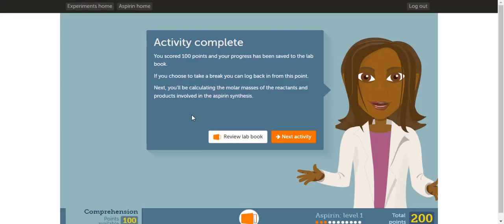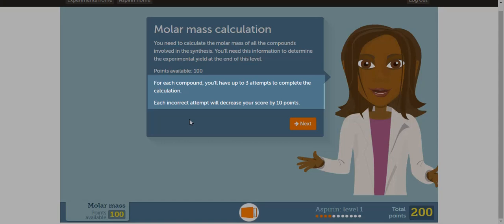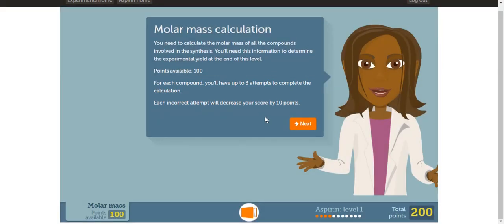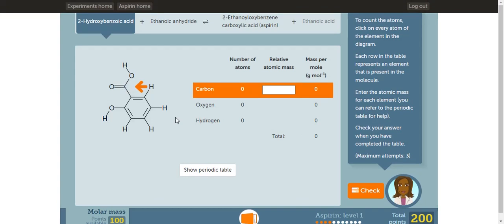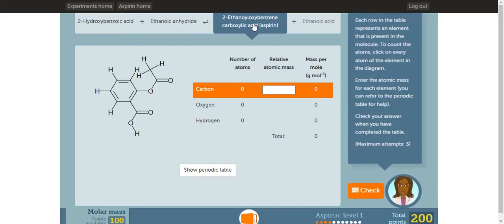The next activity involves calculating the molar mass of the reactants and products in the aspirin synthesis. Once you're ready, click next activity. In the next activity, you have 3 attempts to calculate the molar mass of each substance. Each incorrect attempt will decrease your score by 10 points. In this activity, you'll be calculating the molar mass or the GFM of 3 substances. This is the first substance, the second substance, and the third substance.